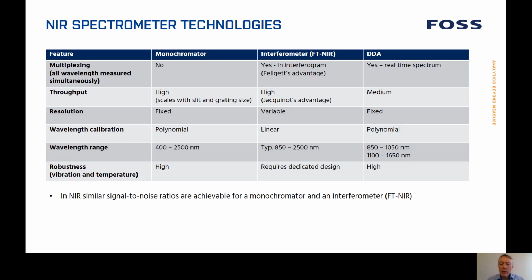We have also found that the DDA spectrometers are good enough in many applications where the highest possible performance is not required, and especially for moving samples, the technology is superior because the whole spectrum is recorded in real time.